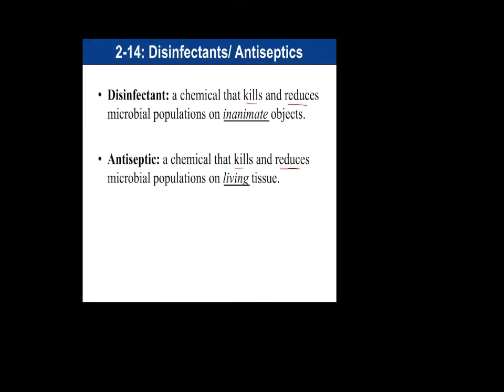So at this point in time, we have incubated our plates, and we're going to read out the results. So we are testing different disinfectants and antiseptics. Let's define these terms. A disinfectant is a chemical that kills or reduces microbial populations on inanimate objects.